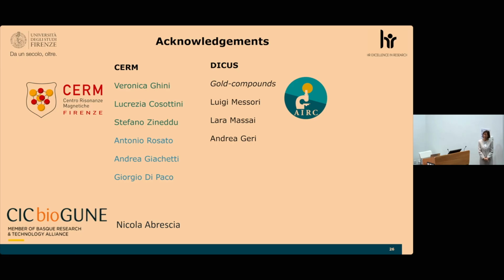Then assigning them, and we were not able to assign everything because the overlap is not that obvious, and then transfer this assignment to the per-deuterated sample in solution, but just using the carbon-13 NOESY, which is not obvious, but we were lucky because the patterns are preserved between solution and solid state, which is not that obvious in terms of chemical shifts.